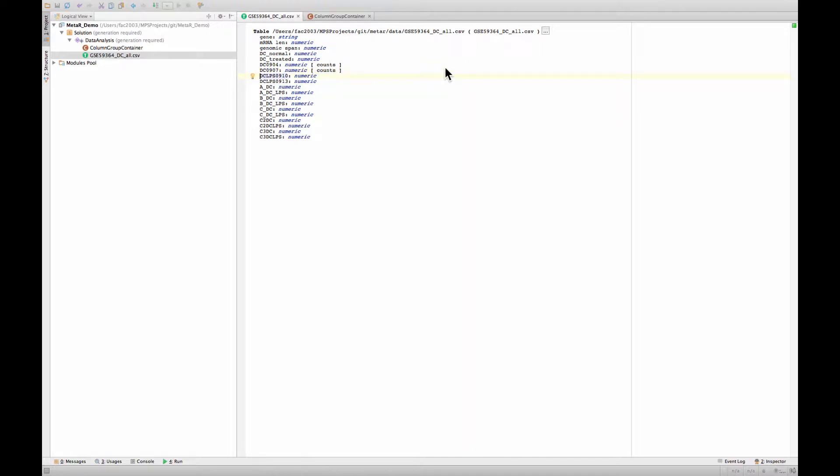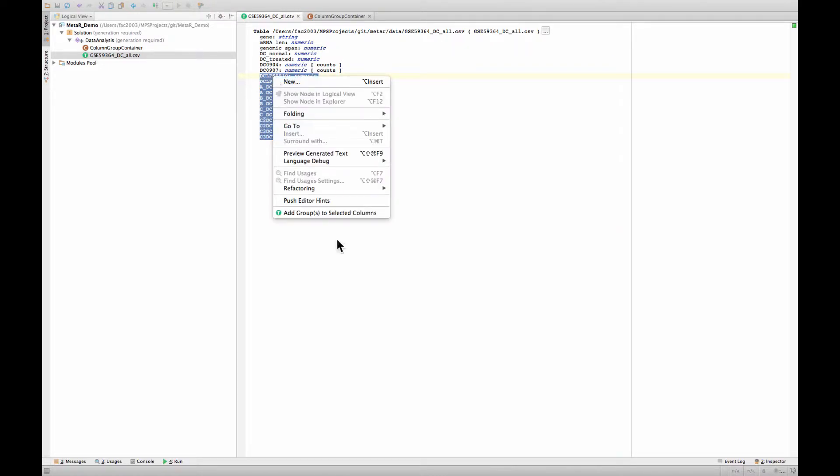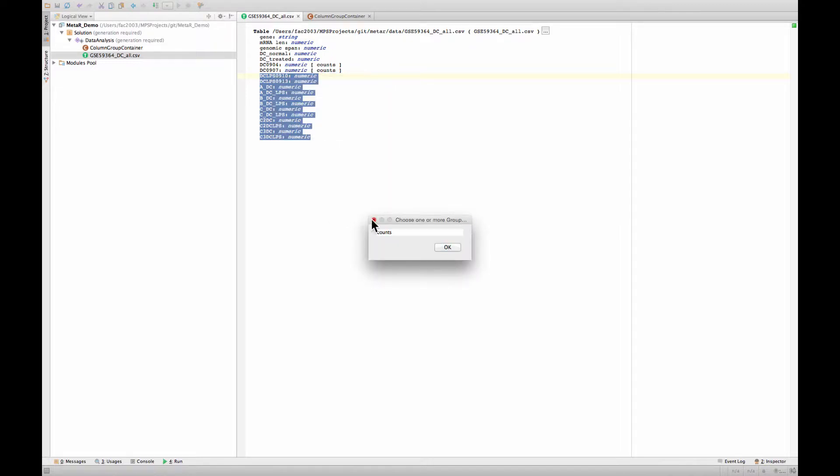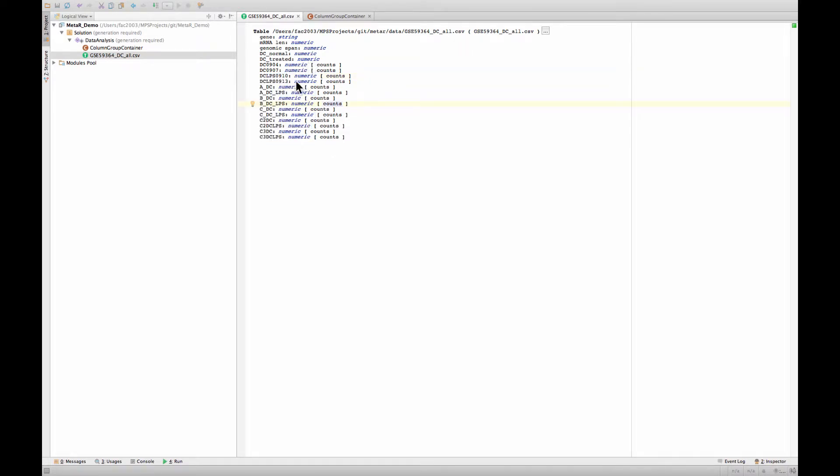There are several ways to continue to annotate those columns. The easiest is to just select all of them and say add groups to selected columns. Then I choose the counts group, and here we are. All of these are annotated as being counts, and that's useful for further analysis.